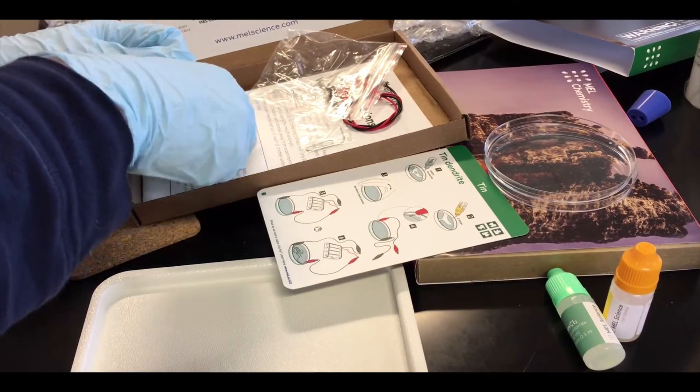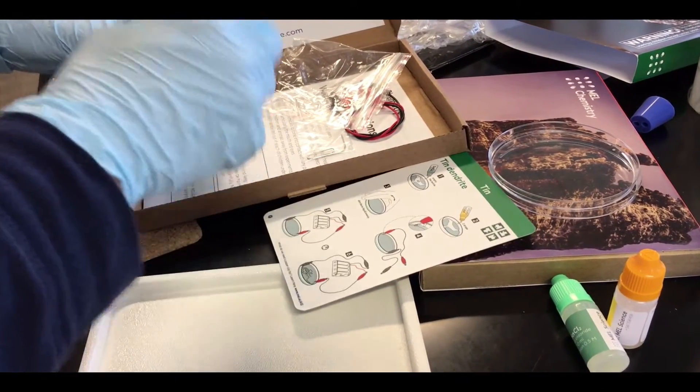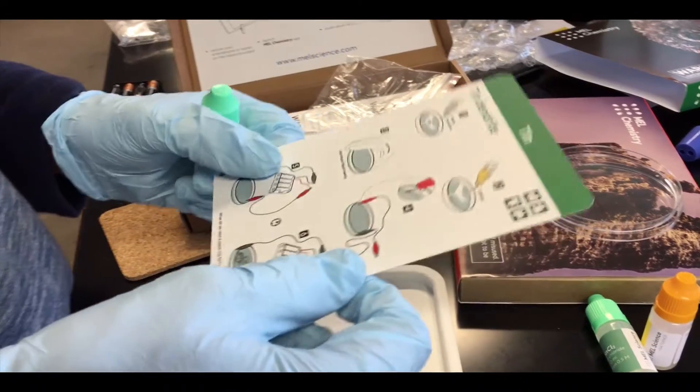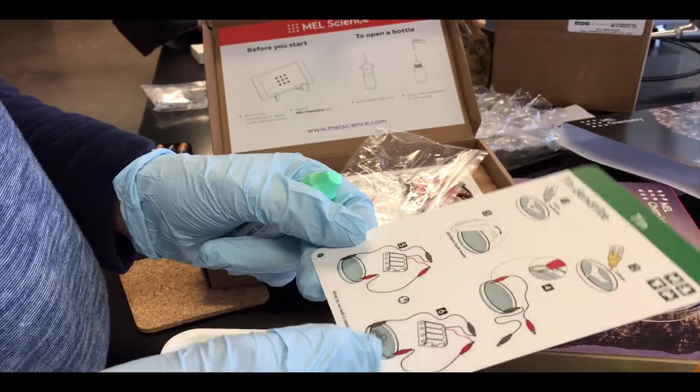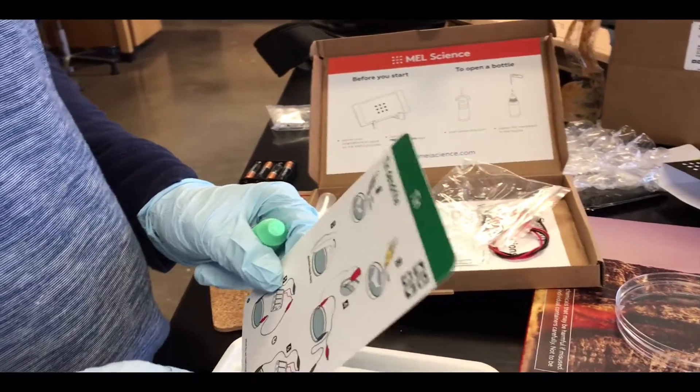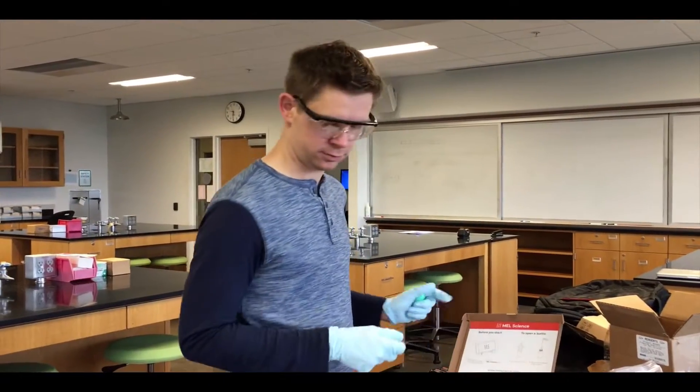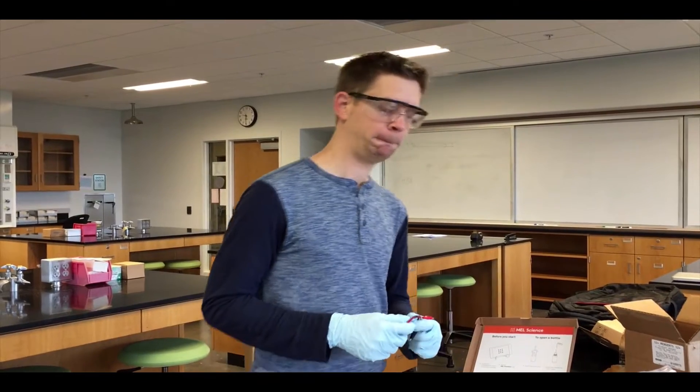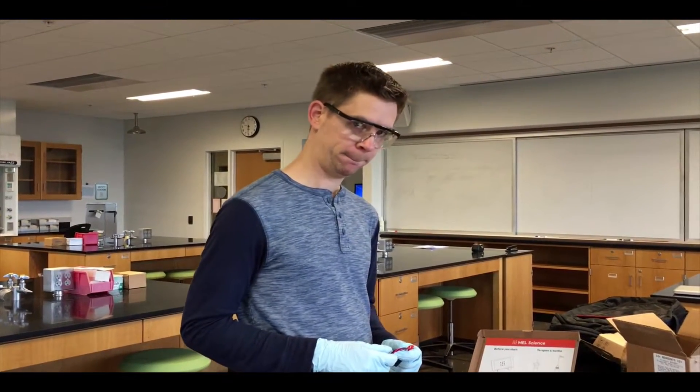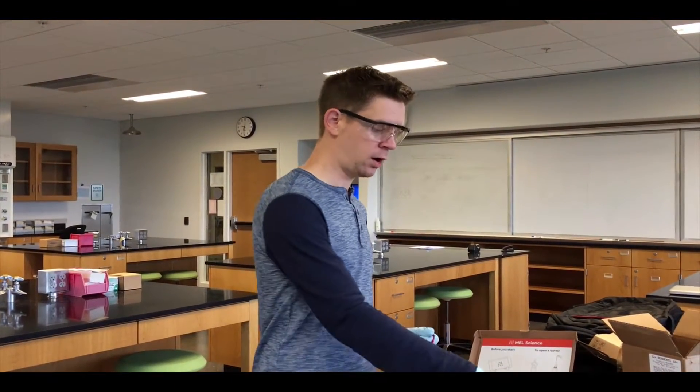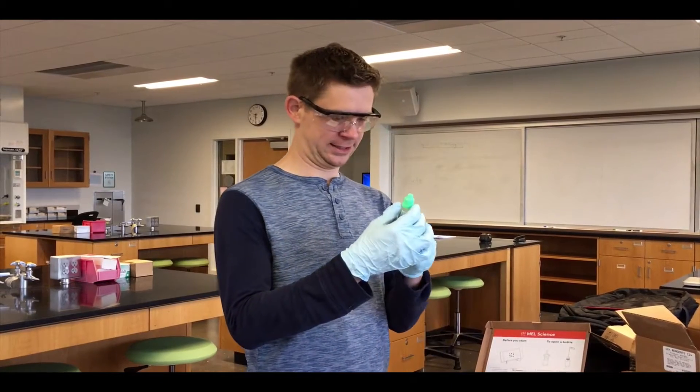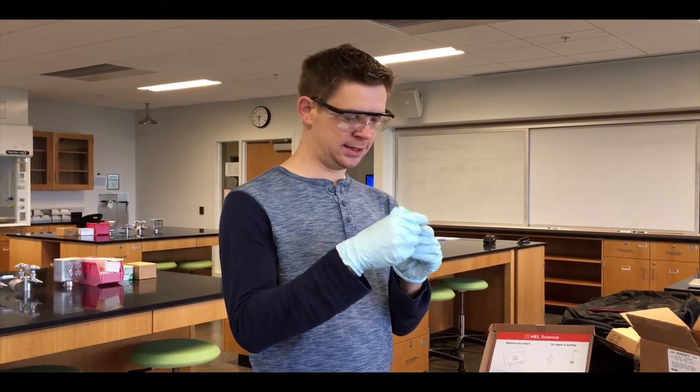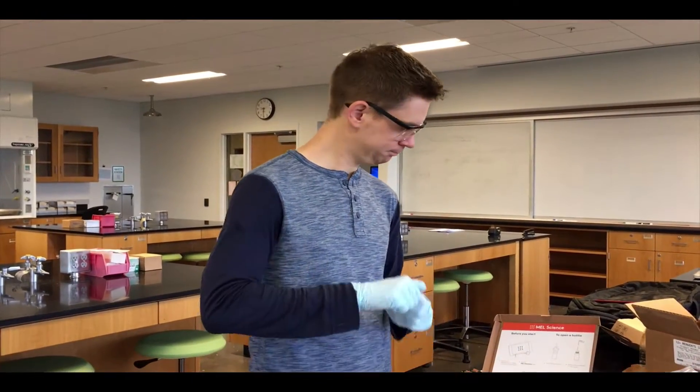So what are we doing now? We are now doing the tin dendrite experiment which is going to grow little strings of tin in a petri dish. In this kind of reaction in general, the products of the reaction have more free energy than the reactants, so you need energy to make that reaction happen.